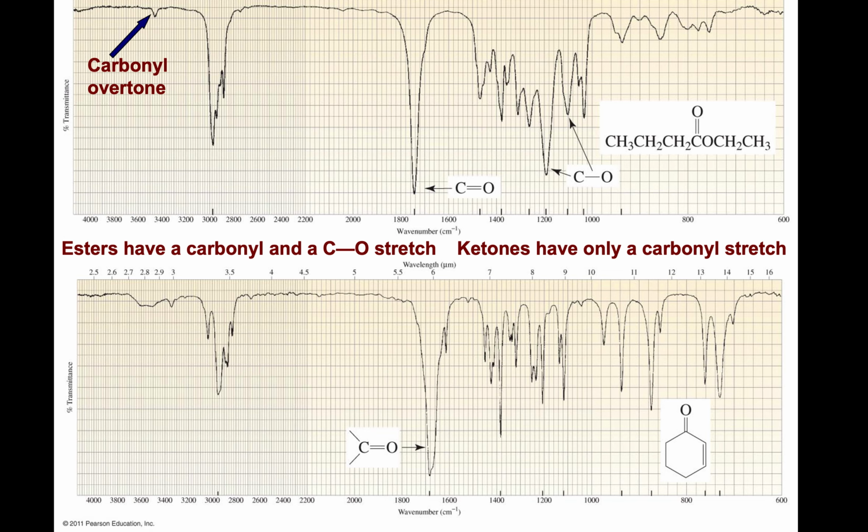Now, you never run an infrared on a compound that has contact with water, if it's wet, because if you're using potassium bromide plates to run a thin film, let's say you have a high boiling liquid and you want to run the infrared, you would smear it on a potassium or sodium chloride or potassium bromide plate, because they're transparent, the latter, and get the infrared as a thin film.